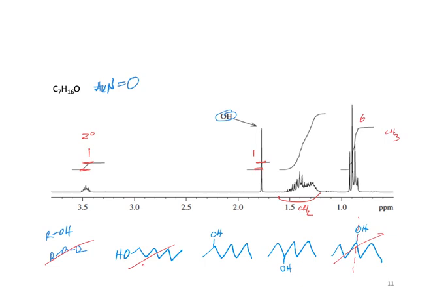it's asymmetrical. Well, I get both of them. It makes more sense. I can't figure out. They're 2 triplets. They're at like 0.9. Right, so we could have one here, here, and here, and then the other one like here, here, here, and they're kind of just overlapped in there. But it could be like there's a doublet and then a triplet. Yeah, which would be the left one? It was a double triplet.